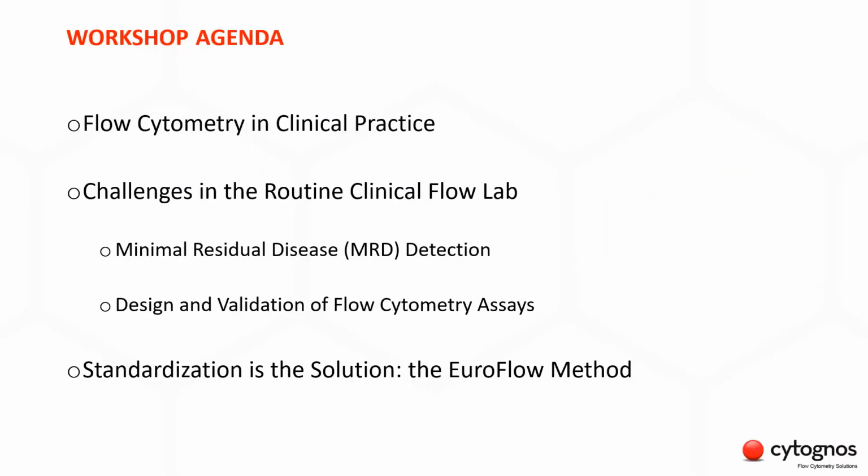So now we are ready to start. These are the points we are going to cover today. First, I will start off highlighting the value of flow cytometry in clinical practice, and then I will talk about the current issues we face in the clinical routine lab, and I will focus on the specific challenges of the minimal residual disease assays and on the design and validation of flow cytometry tests. And finally, we will see how we can overcome these challenges with a fully standardized solution that is the Euroflow method. And at the end of the webinar, we will have a few minutes for questions, so you can write them on the question box you can find on the right part.